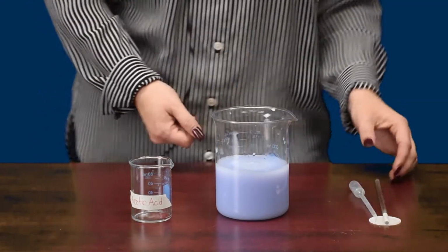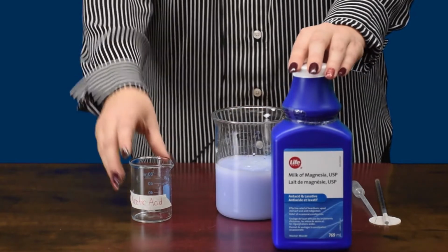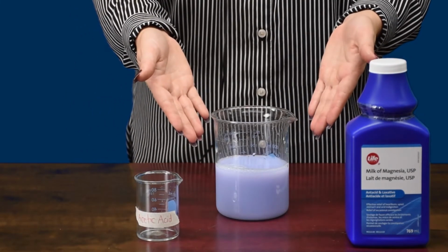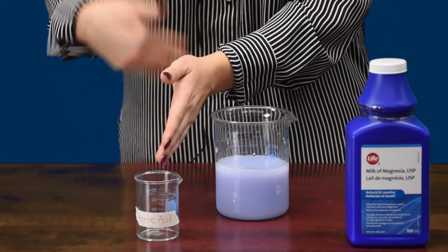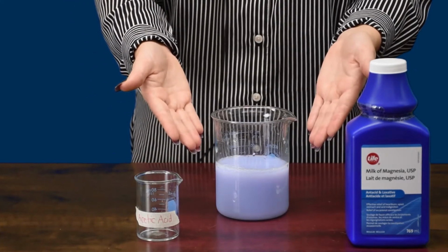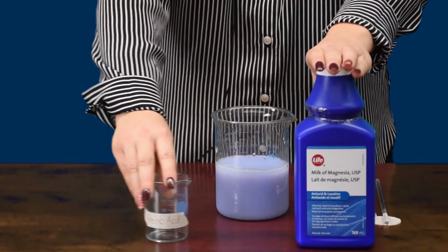So to explain to you a little bit why this is happening, we know that our milk of magnesia is a base, and we know our acetic acid is an acid. Okay? The universal indicator stays this purple color when the solution is basic. When we add the acid to it, the acids tend to stay a lighter color. So when we add the acid, it becomes a lighter color. However, since there is a higher quantity of base inside our beaker, it always will eventually go back to purple unless we add equal amounts of base and acid.